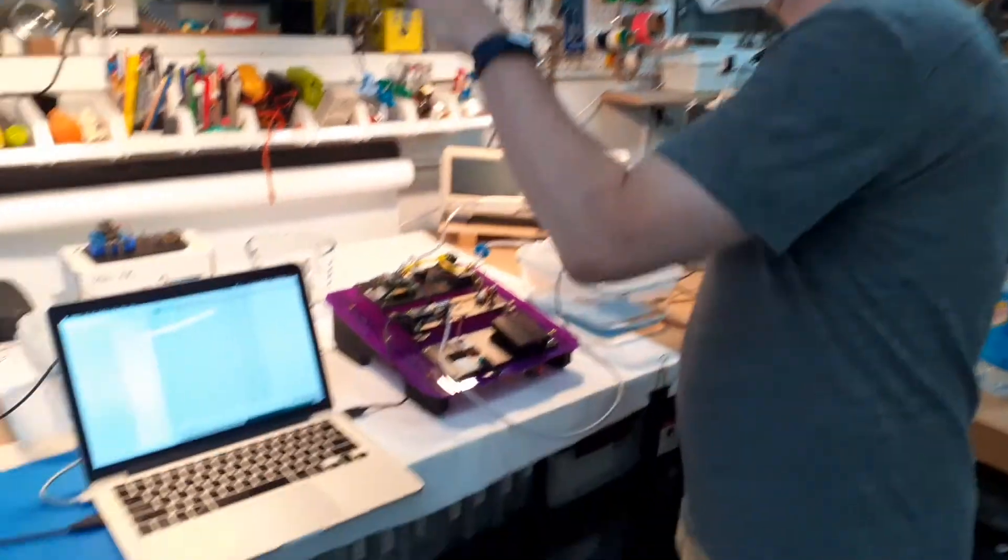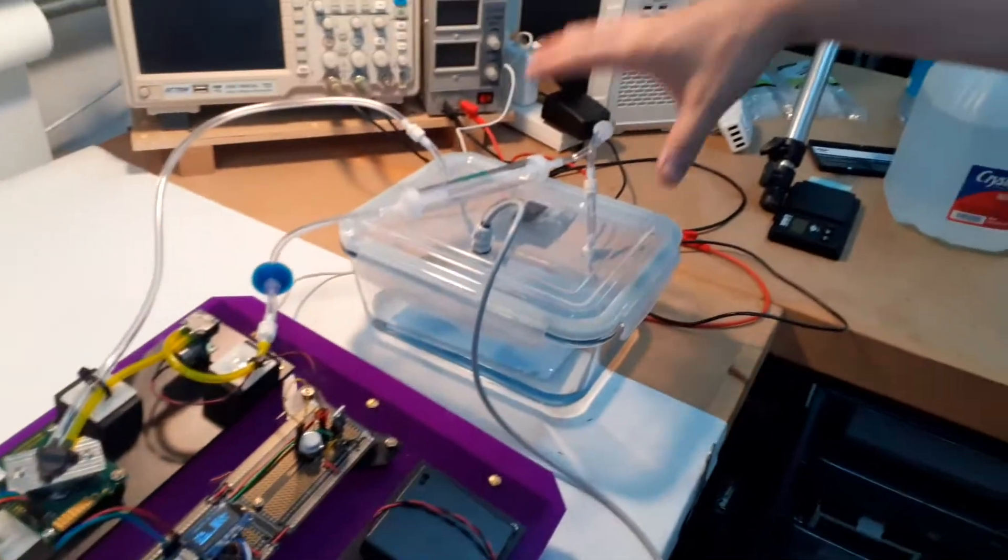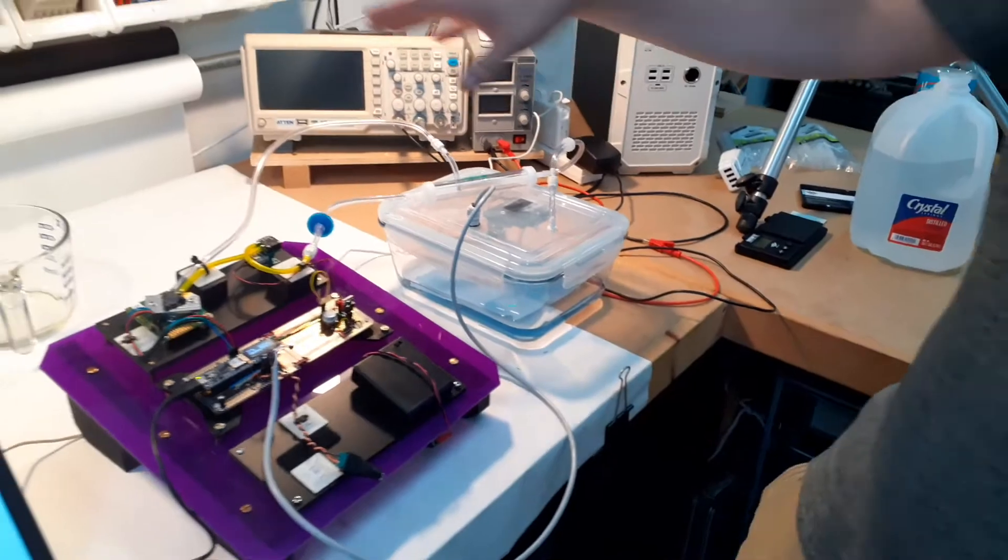Right now what we're doing is we have two sorbent testers going. Which ones are those? This one and this one. These are two sorbent testers. This is the more advanced, more complicated one. This is a simplified version, but we decided the simplified version was good enough for our purposes.